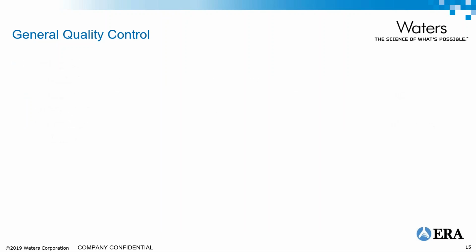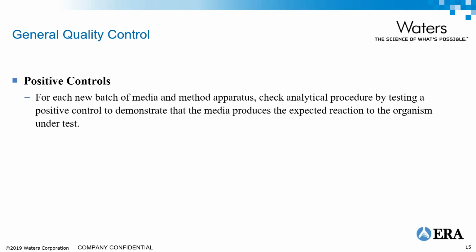Okay, so the next big thing related to control is you want to run positive controls. Every new batch of media and the method apparatus, you want to check your analytical procedure by testing positive controls to demonstrate that the media produces the expected reaction under test.